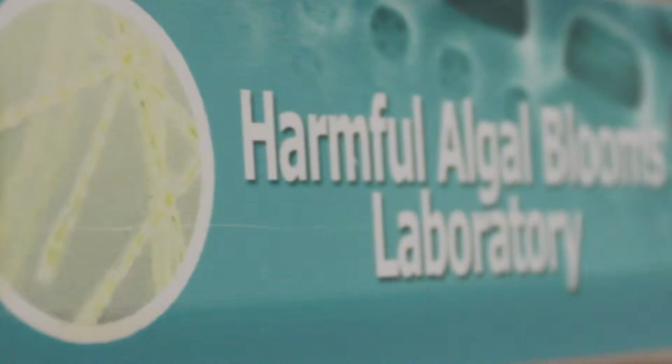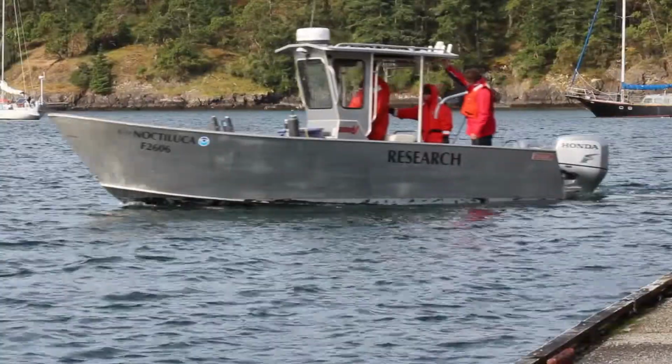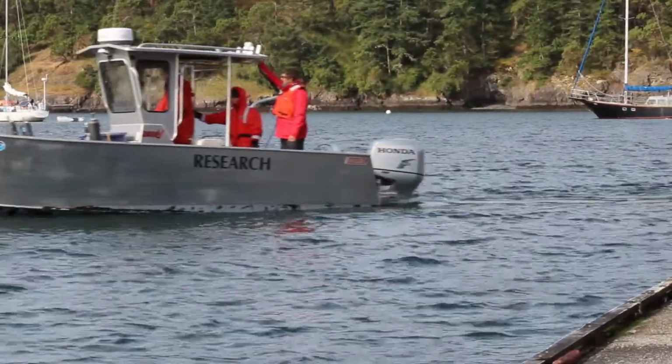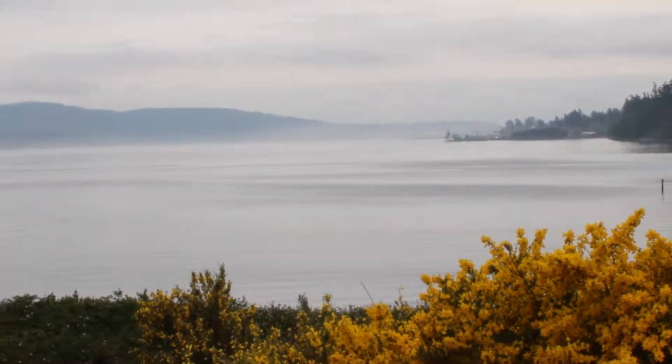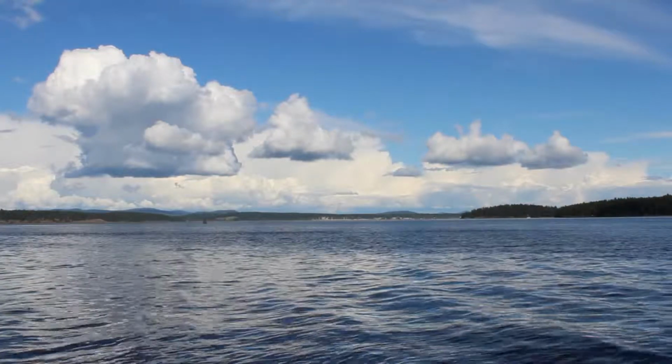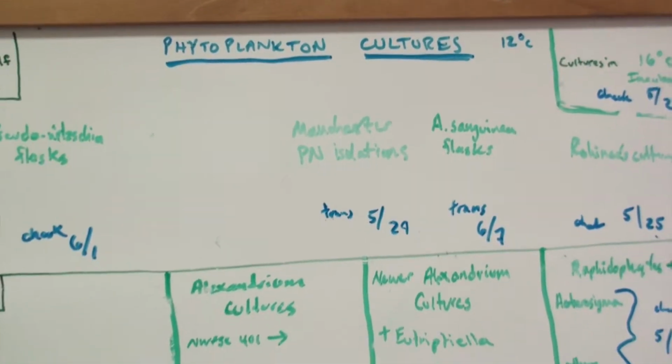In order for scientists to study harmful algal blooms, they need to collect water samples for analysis. Researchers consistently sample water in all parts of the world to keep tabs on HABs, since the ecology of a body of water constantly changes. From a collected sample, HAB species can be isolated and cultured for toxin analysis.